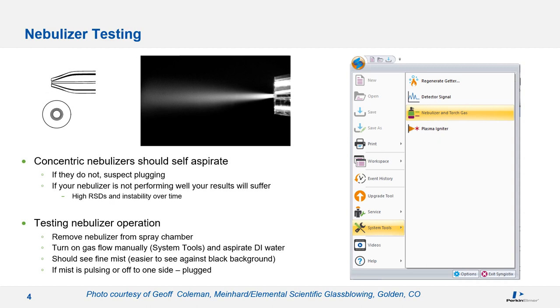To test a nebulizer, remove it from the spray chamber, put the sample tubing that connects to the peristaltic pump in a container of DI water, manually turn on the nebulizer gas using the system tools, nebulizer and torch gas test tool in the Syngistix software. Observe the aerosol against a black background and become familiar with what is normal for your nebulizer. If the aerosol doesn't look normal, you need to perform some maintenance.